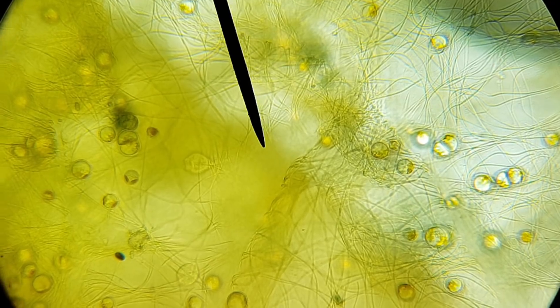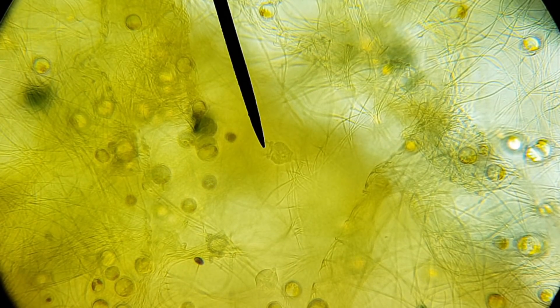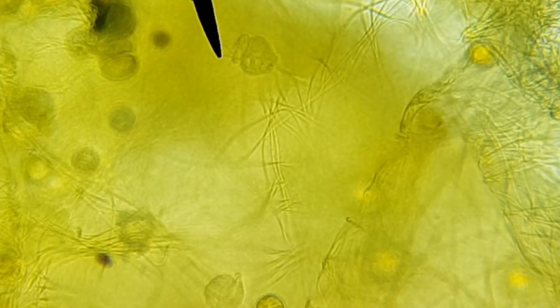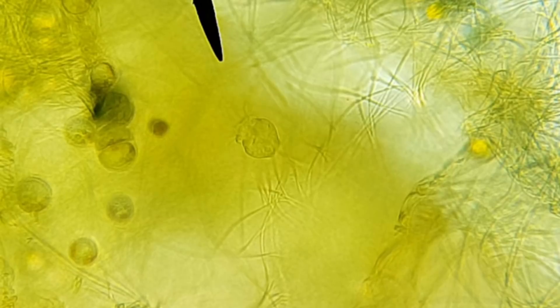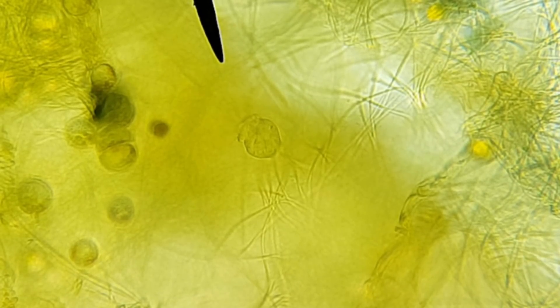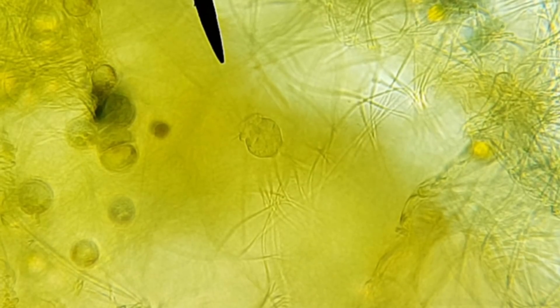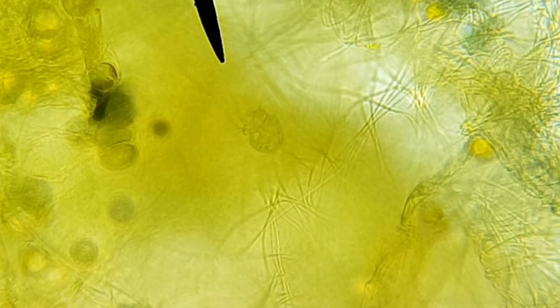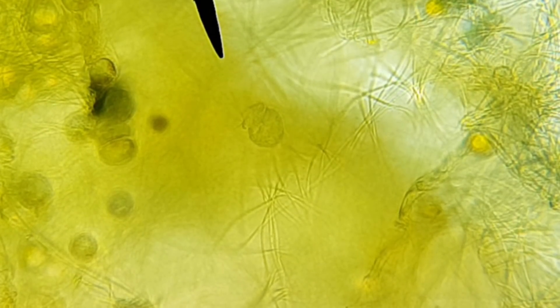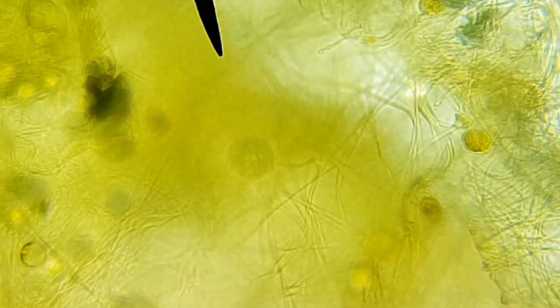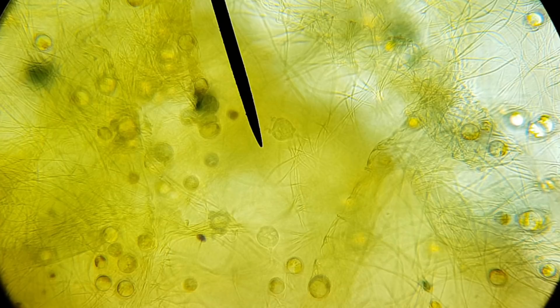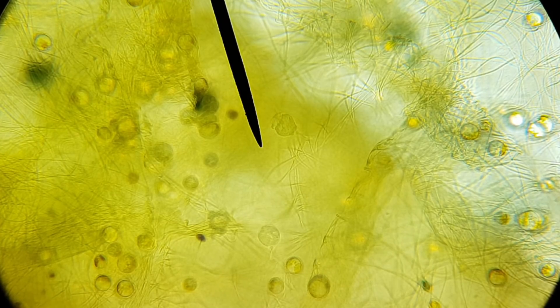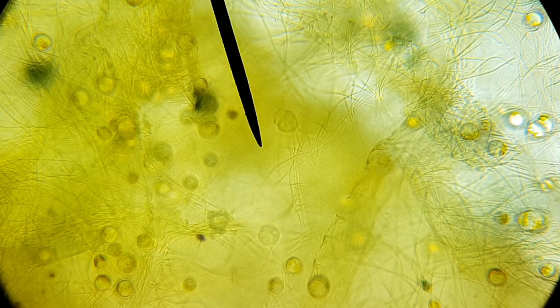I'm actually seeing two of them now, but the lower one doesn't really seem to be very active. Oh, nope, there he goes. I don't know about you guys, but I think this is really, really, really cool. It shows how, apart from the algae, the ecosphere is definitely not dead inside.